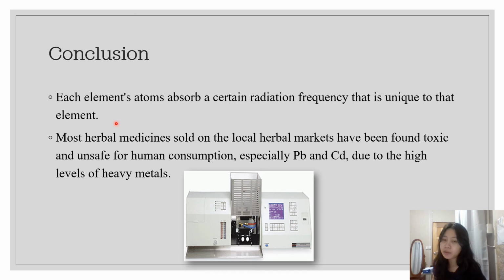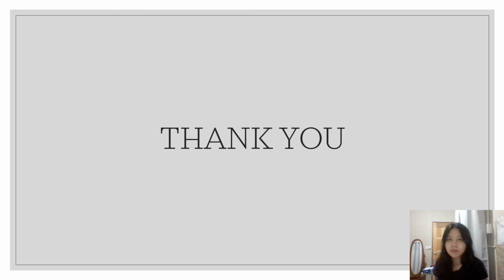So by using atomic absorption spectroscopy, we can determine the amount of heavy metals in the herbal drugs, especially Pb and Cd, due to high levels of heavy metals. That is all from us, Group 1. Thank you.